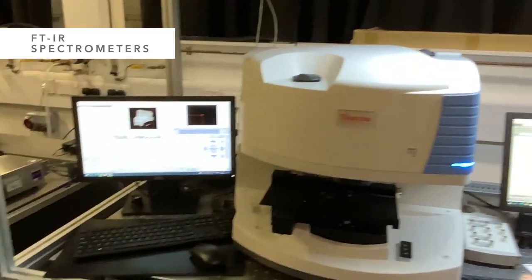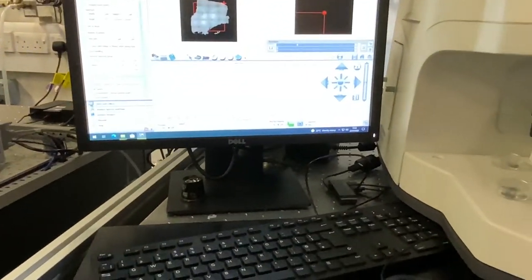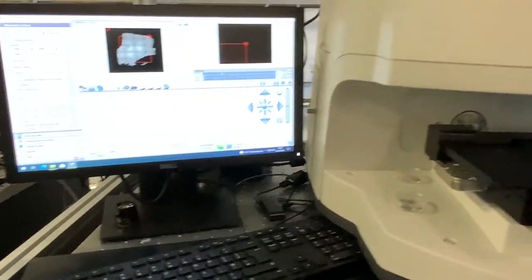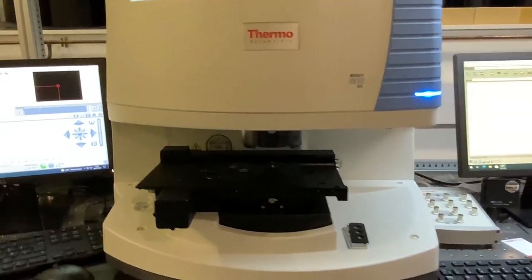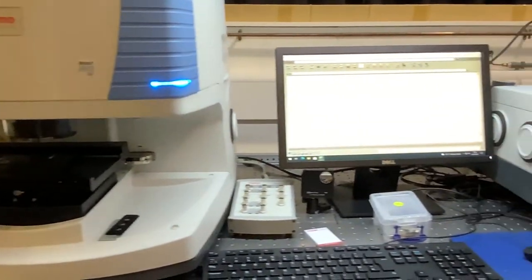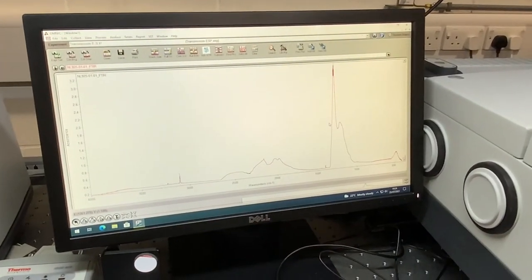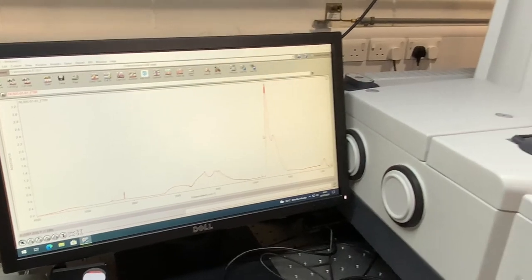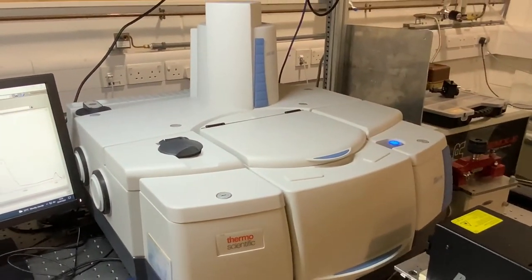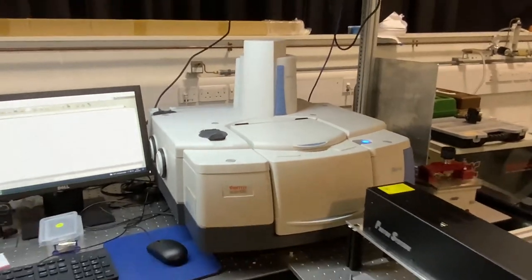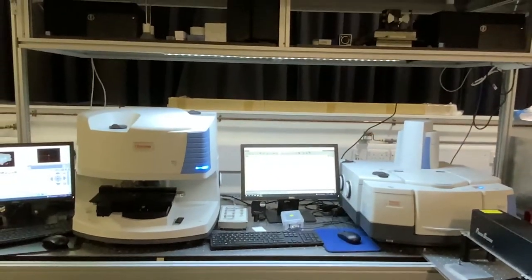Next, we come to our FTIR spectrometers. FTIR, like Raman, uses light to probe the molecular vibrations of the sample to produce a fingerprint to help identify the chemical structure. We have FTIR systems that can measure the absorption of bulk samples across a wide spectral range and have the ability to make time-resolved measurements. We can also produce maps of the IR absorption of samples with our IR microscope, which can also be equipped with a micro-tipped ATR.